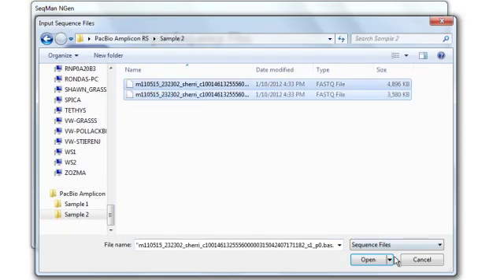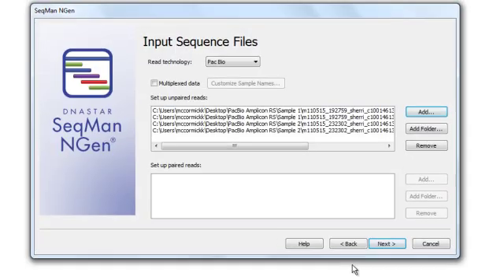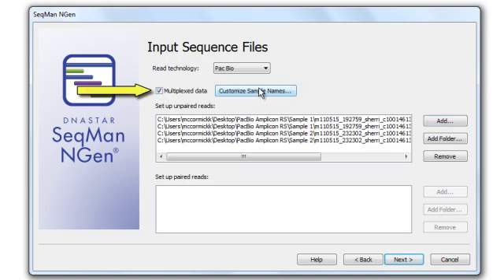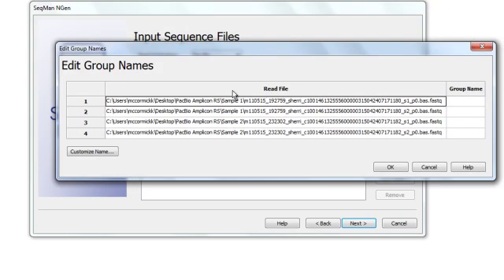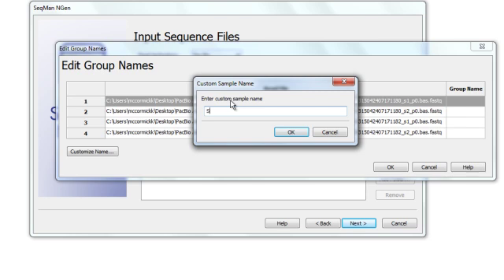As you can see, I'm adding data for multiple samples, and since I'm interested in multi-sample SNP analysis, I'm going to check the box next to Multiplex Data, and then click Customize Sample Names. Here I can specify which samples correspond to which files simply by double-clicking on the file name, and then typing in the sample name.